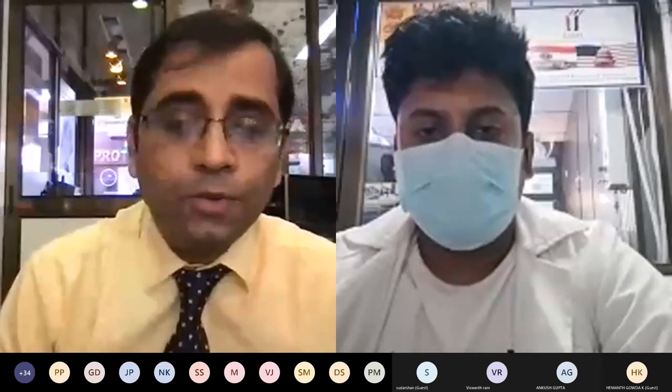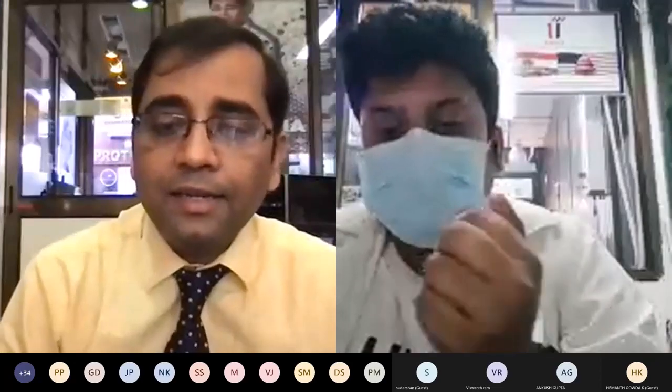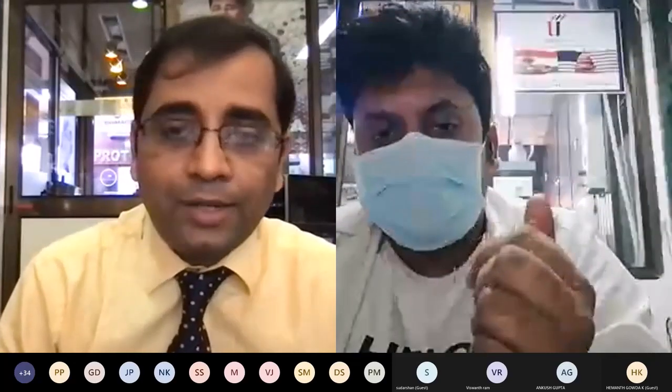I hope you're all enjoying these activities which we are trying to lay down for you. Also the run is getting over for the previous one, and I will discuss how the results look in the subsequent session.